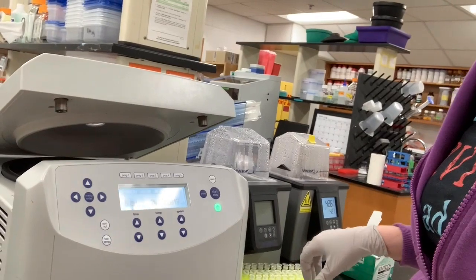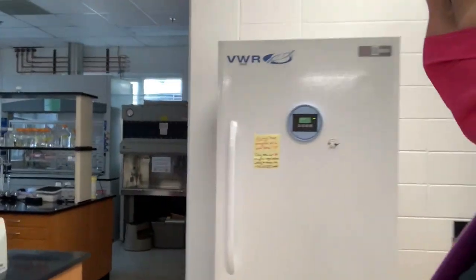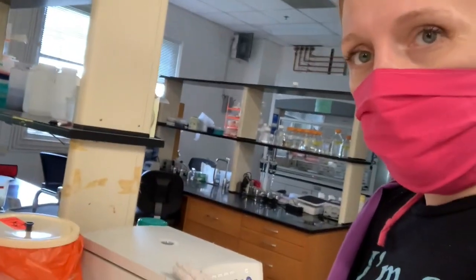We have 2 centrifuges in the lab. On the side nearest to the entrance of the lab, we have this centrifuge, which is a temperature controlled one. This is the one I'm going to use today. I can show you that in the other part of the lab, there's also a second one. This one can also be used. And this one is not temperature controlled.